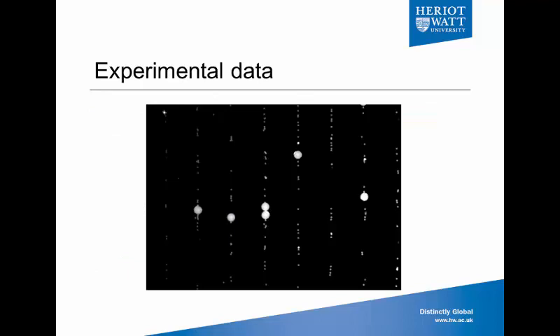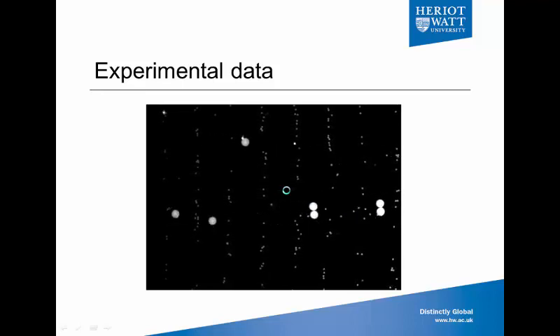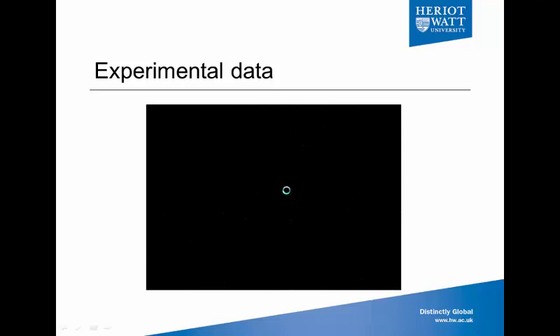And this is a movie of the experimental results. So you can definitely see that the large particles of 45 microns move with the field while the smaller ones stay in their initial position.